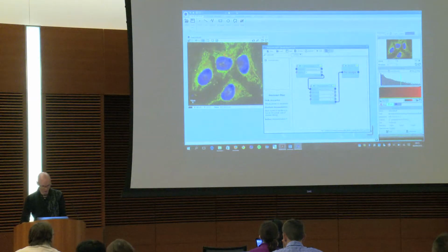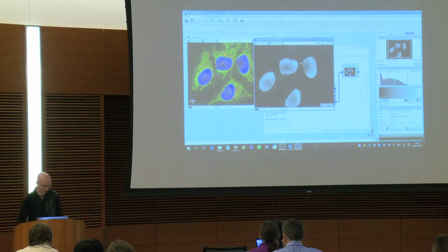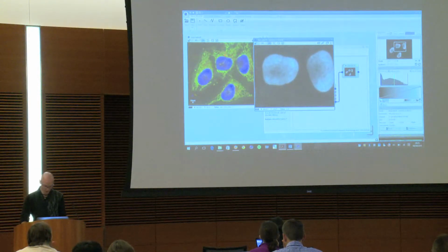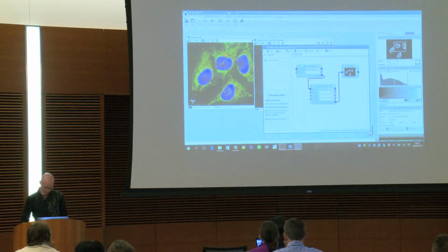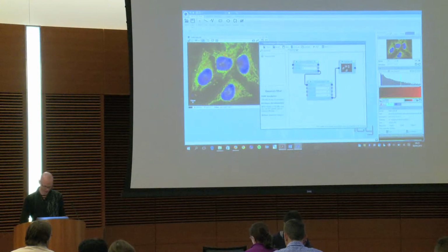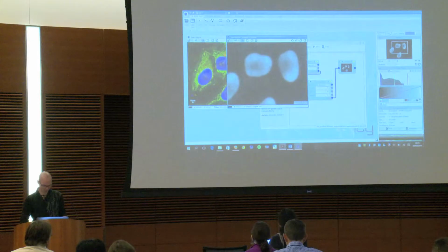Then we can reset the state of the protocol and run it again to verify that we have the expected result. So you cannot see the difference maybe, but we can see that the Gaussian filter is applied. Or not. It's not applied because actually my sigma was kept at 0. So there is no difference. So this time, if I run it again, you can see that the filtering is correctly applied. Okay?